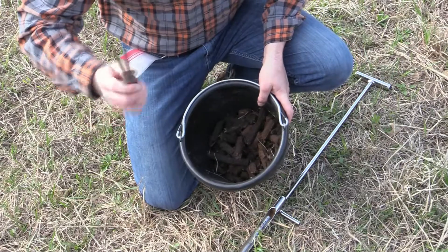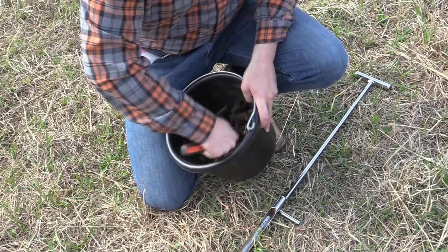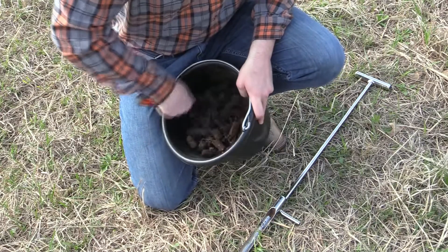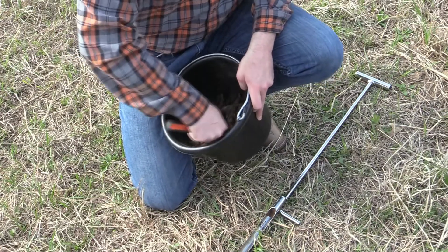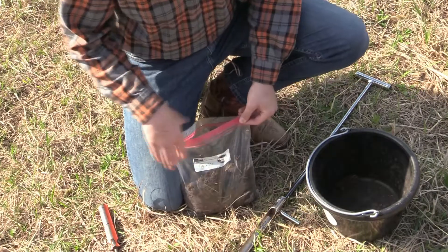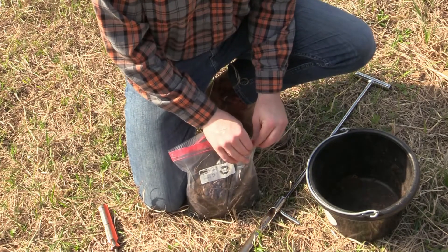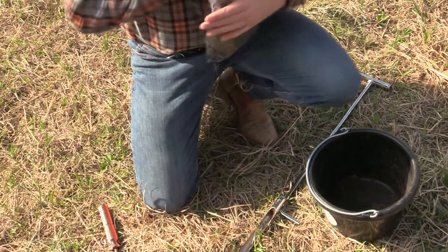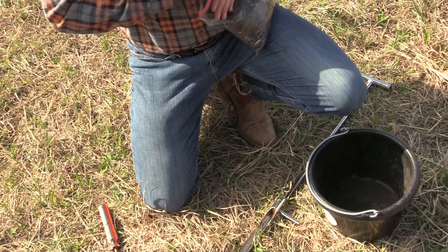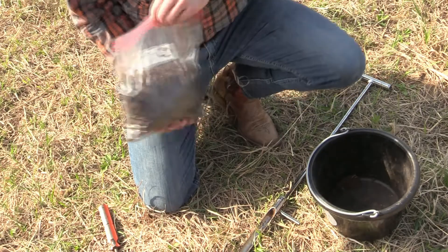Once we've gotten our 10 to 15 samples, I use that same screwdriver, knife, or your hands — get it mixed up and incorporated together. I've got it labeled with my name and what sample it is. I'm only taking one in this instance, so I don't really need much labeling, but go ahead and zip it up, take it to the office, pay for it, and we'll send it off whenever it's ready.